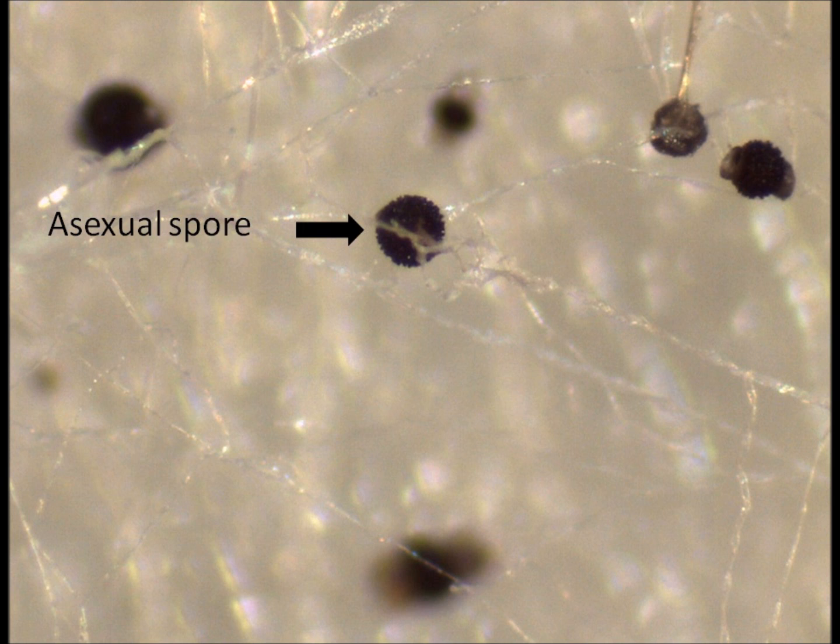So what you need to do now is to dissect out some of the sexual spores and prepare a wet mount so that you can observe them at higher magnification using the compound microscope.